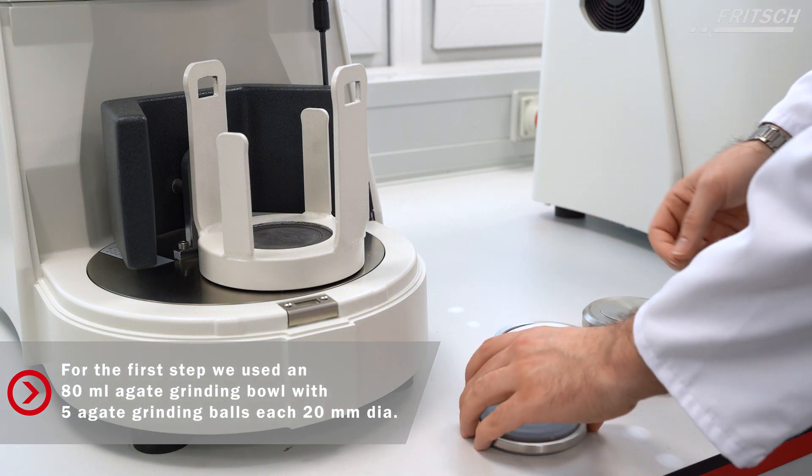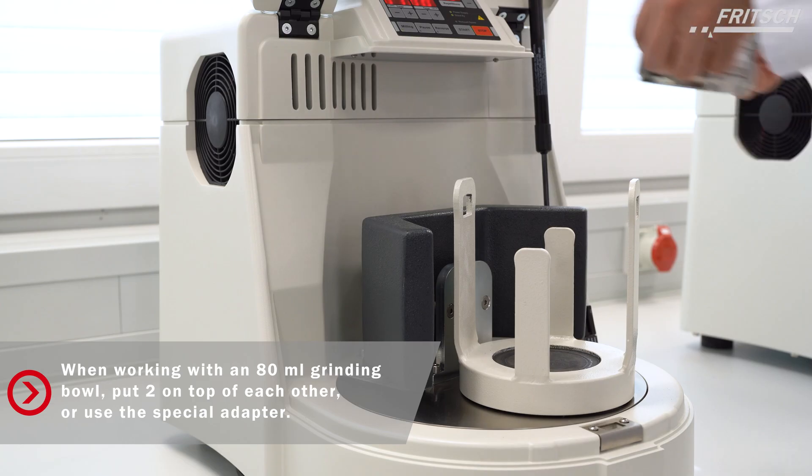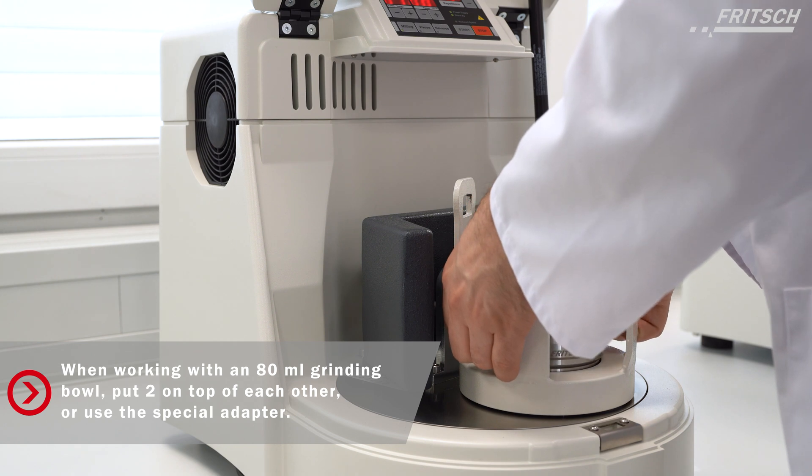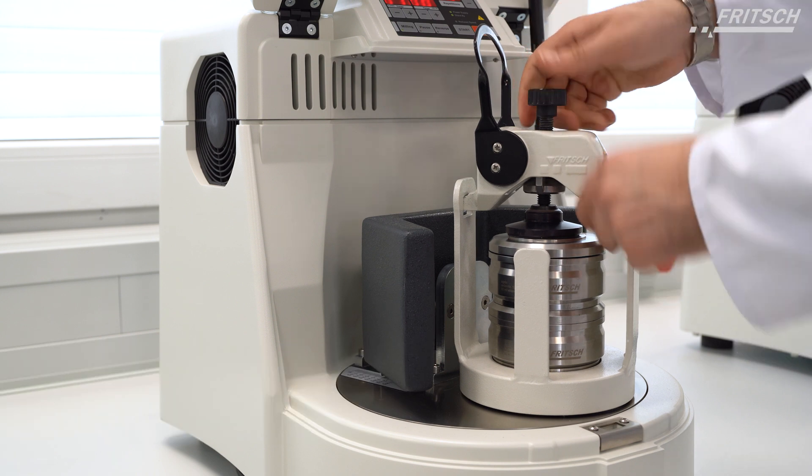It is possible to use two 80 milliliter grinding bowls on top of each other. This way, you can grind a sample with different grinding materials or even different samples simultaneously. Otherwise, use the special adapter for grinding balls.